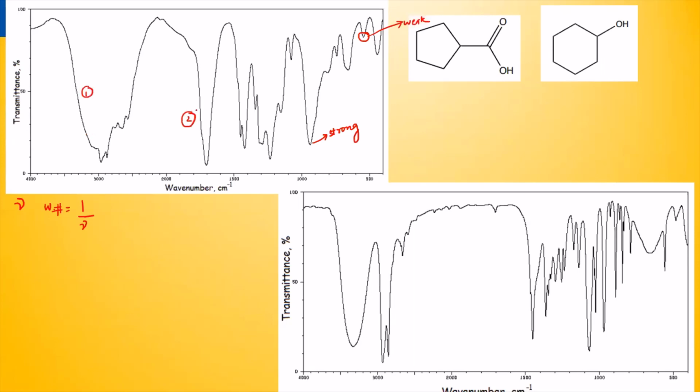There are some characteristic peaks, and for 1, you see these peaks are literally filling up the space. So 3, maybe this one right here, and maybe this is 4. Don't do more than 4, because normally you can get away with just 2 or 3 at most. 1 or 2 would even help you narrow it down.